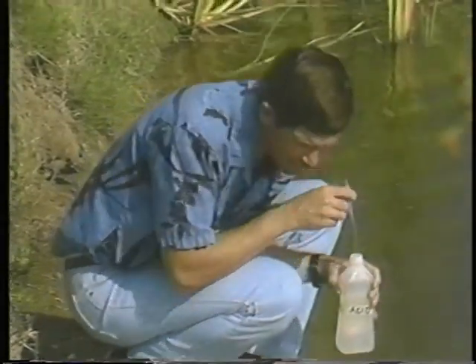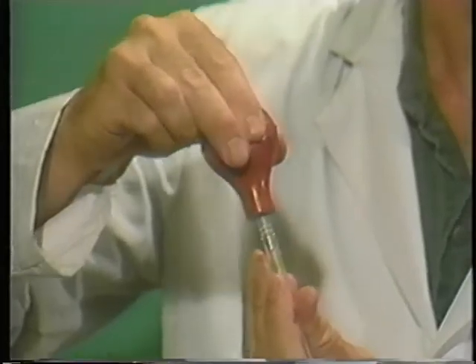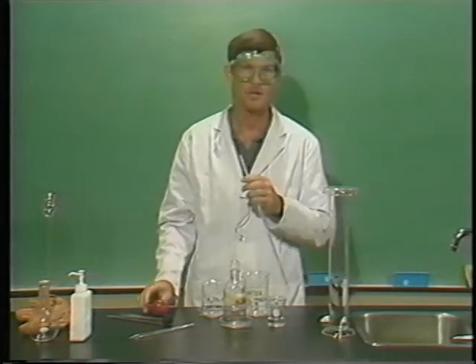It was really scary. Whenever you use a pipette, always use one of these little mechanical bulbs on the end so that you can squeeze the air out and then suck in the right amount of liquid. Never ever use your mouth on the end of a pipette. I learned that one the hard way.